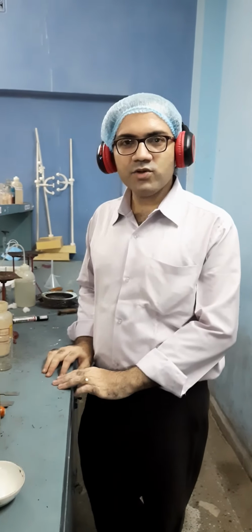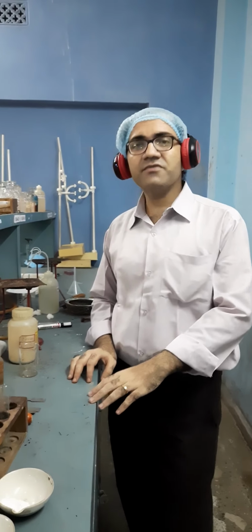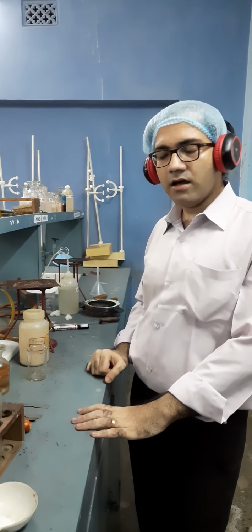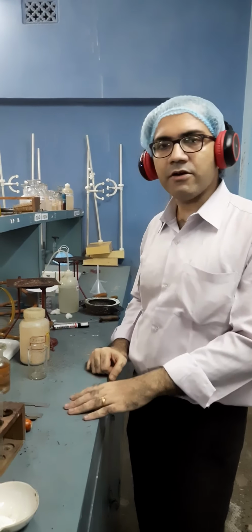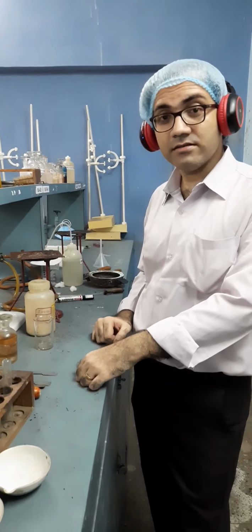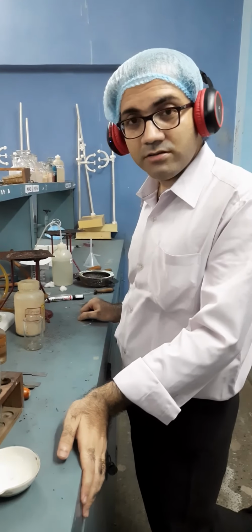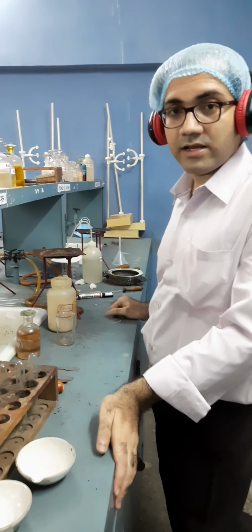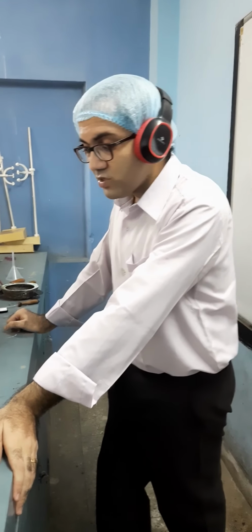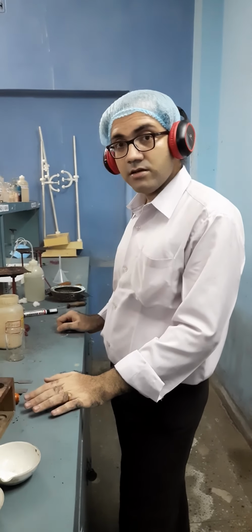So today, as I promised, we will be continuing with some more practicals, more demonstrations. Today I am going to perform some different sorts of experiments. The first experiment is basically the reaction between sugar and sulfuric acid. It's quite an interesting experiment. The reaction is a bit exothermic in nature. We are discussing what exothermic reactions are and what happens. We will see what happens when concentrated sulfuric acid gets to react with sugar.